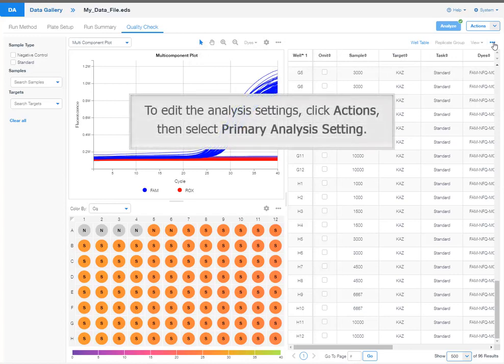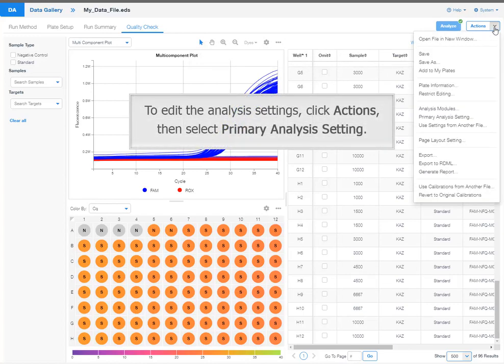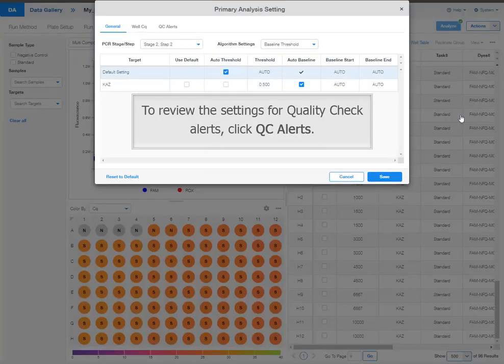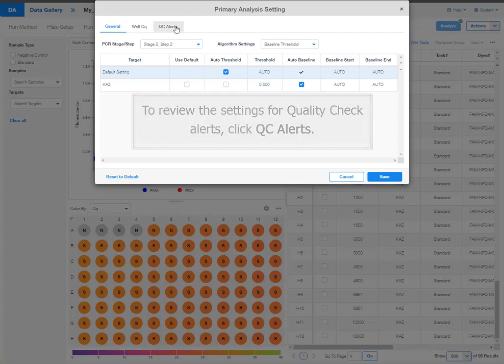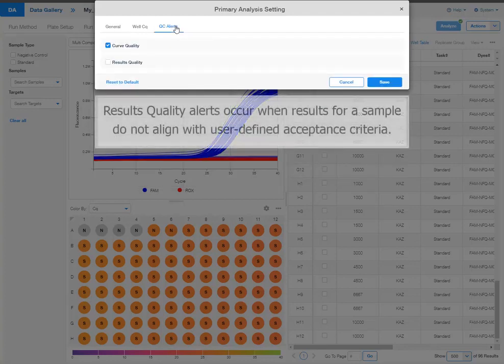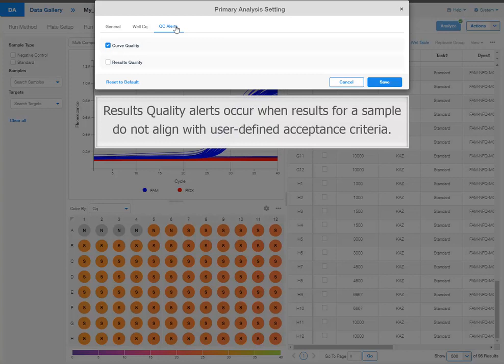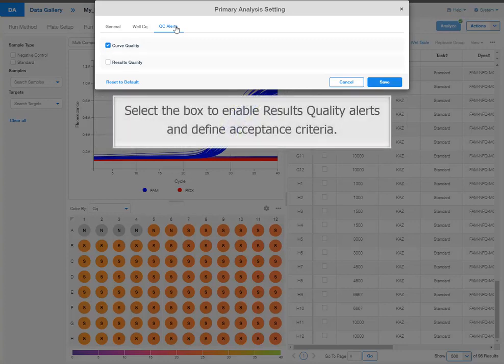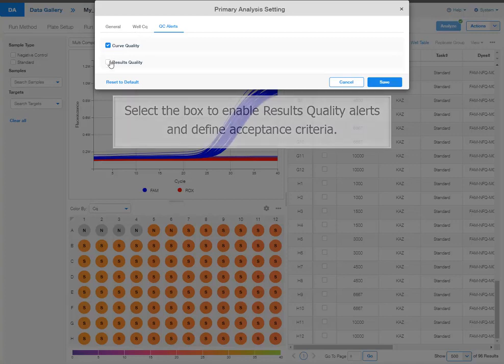To edit the analysis settings, click actions, then select primary analysis setting. To review the settings for quality check alerts, click to see alerts. Alerts for curve quality are enabled by default. Results quality alerts occur when results for a sample do not align with user defined acceptance criteria.